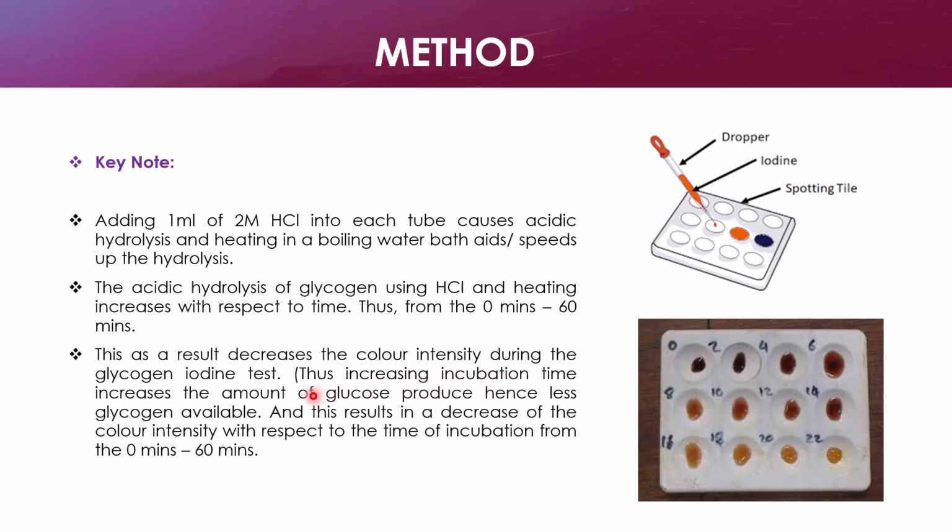Thus increasing incubation time increases the amount of glucose produced, hence less glycogen available. And this results in a decrease of the color intensity with respect to the time of incubation from the 0 minutes to the 60 minutes.